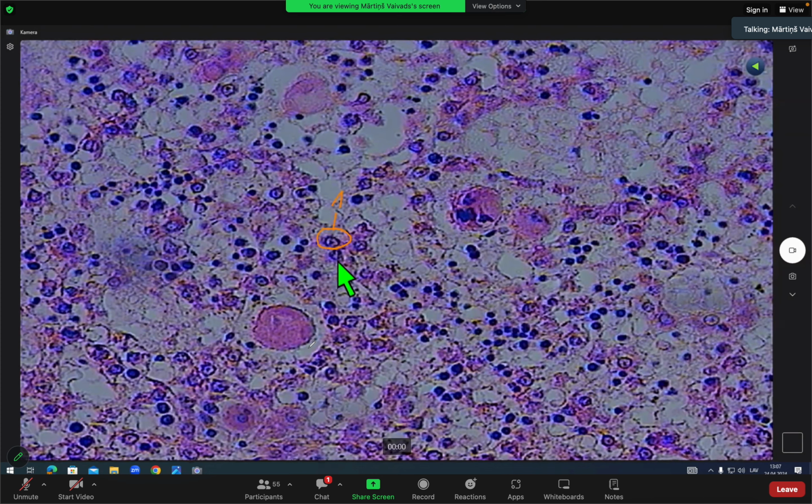Developing hepatocyte. These cells look almost like adult hepatocytes. They are not big cells, but relatively medium-sized cells with a nucleus, nucleolus. Some inclusions are present. So, hepatocytes.